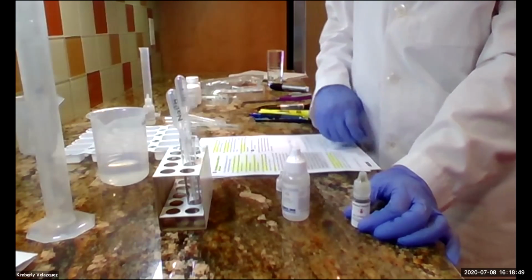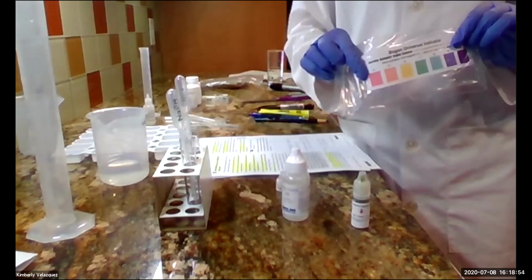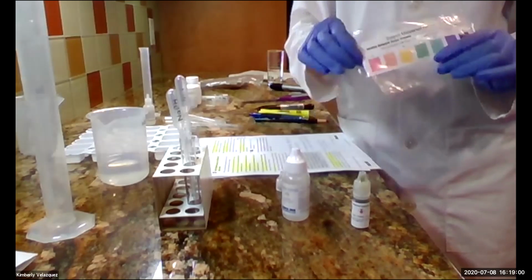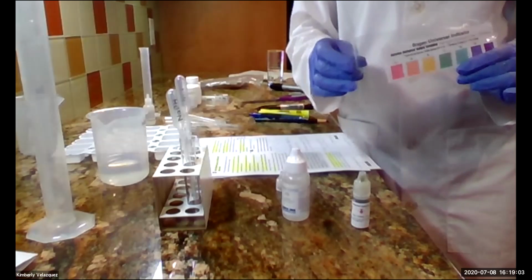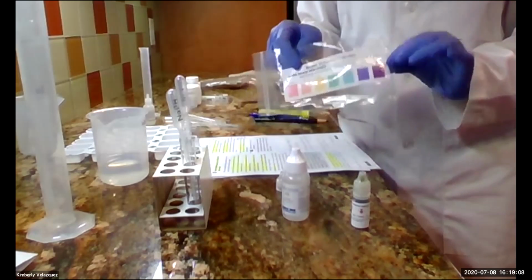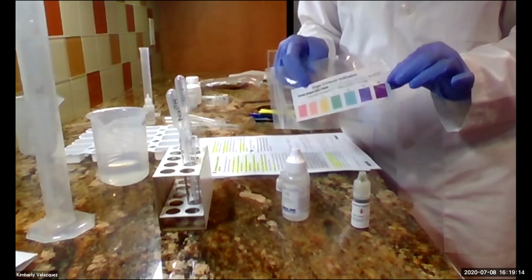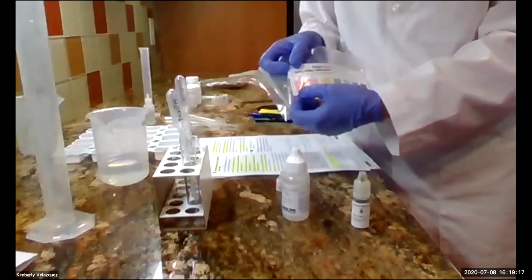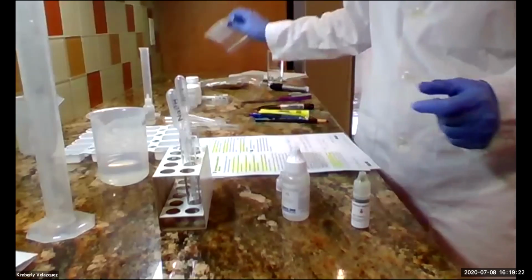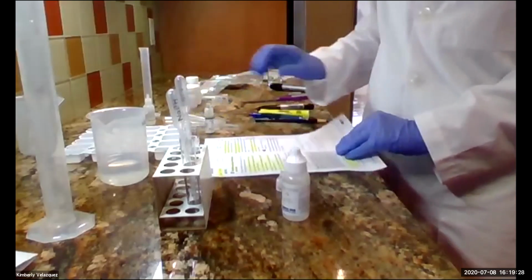So if you end up looking at your pH chart and you see that something is reading at pH 4, you'll actually record that as equal to 4 or less than 4. So less than or equal to 4. Okay, and then the same at 10. If you record a pH 10, that could actually be higher than 10. So you're going to say greater than or equal to 10, because this pH indicator can only read 4 to 10. Okay, so you're going to put the drops of pH indicator in your test tubes and you're going to note the color of that.